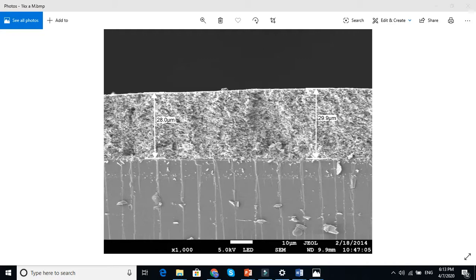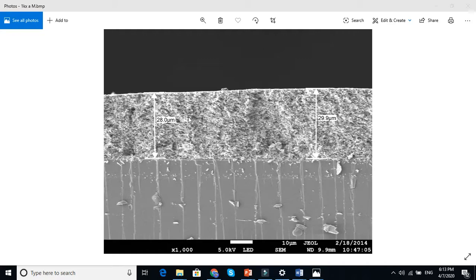So in this video, I am going to show you how to measure the thickness. And when we zoom it, you know this layer is a very thin layer. You see it is in micron. So now we are going to show you that when you have a nanostructure material and you want to make a paste, a paste means something like a paint.